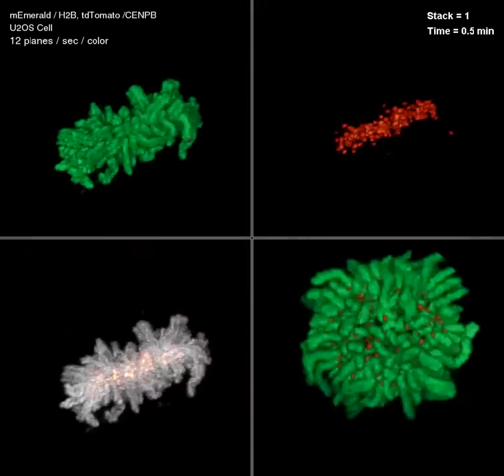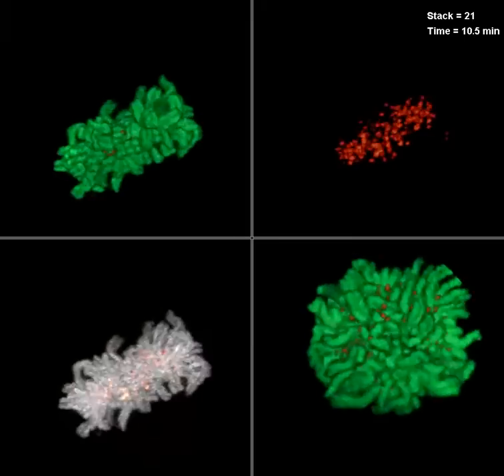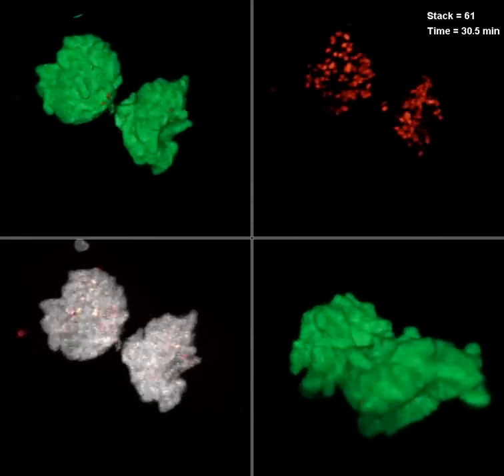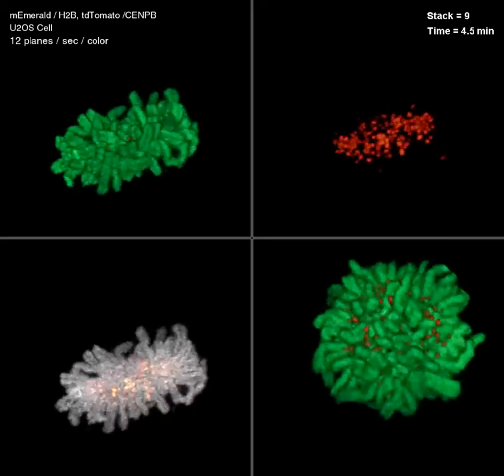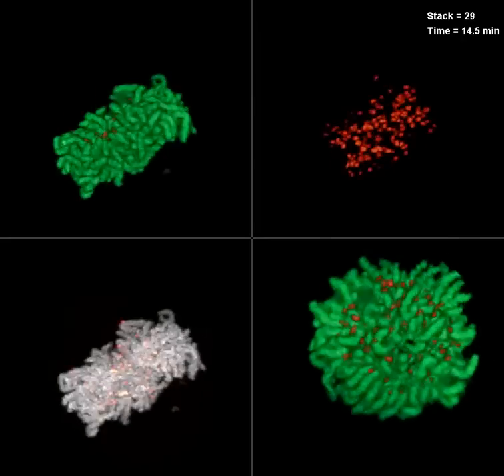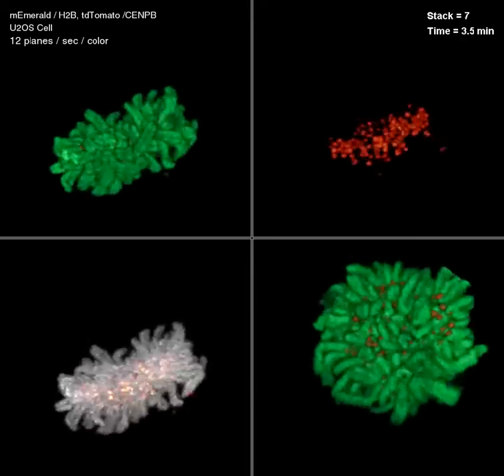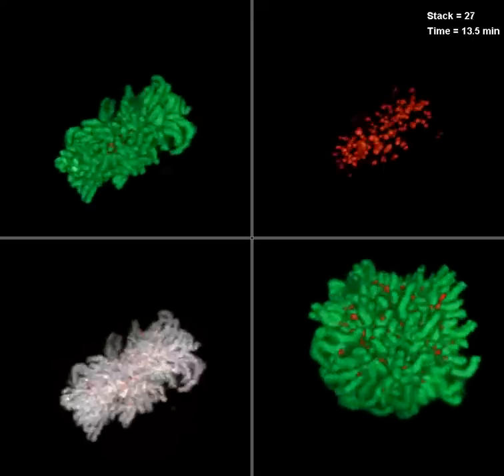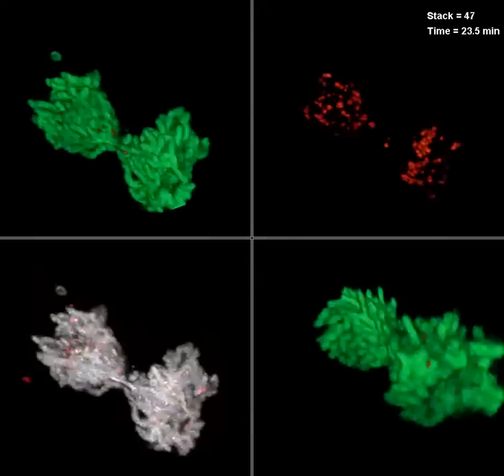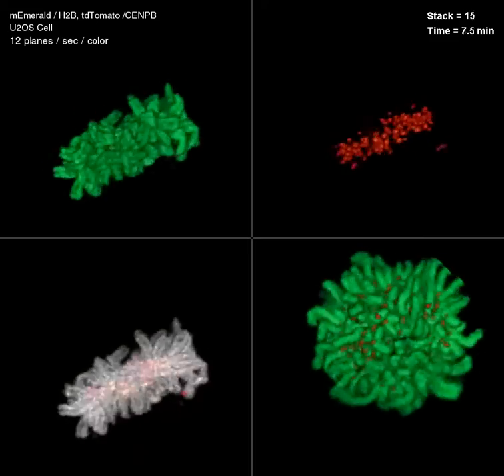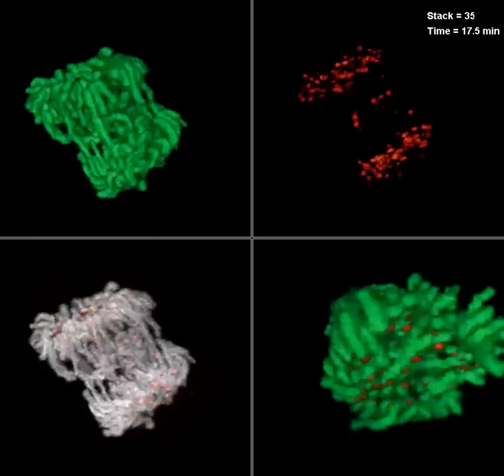And what you're seeing is the mitosis from the metaphase stage through anaphase and then telophase after the cell is divided into two daughter cells. The green is the chromosomes, and the red are the kinetochores, which act as the attachment points to which microtubules, these cytoskeletal members, come and pull apart the two chromatids.